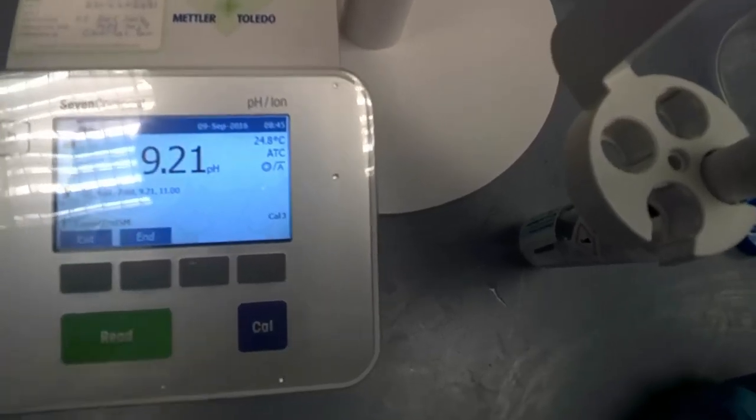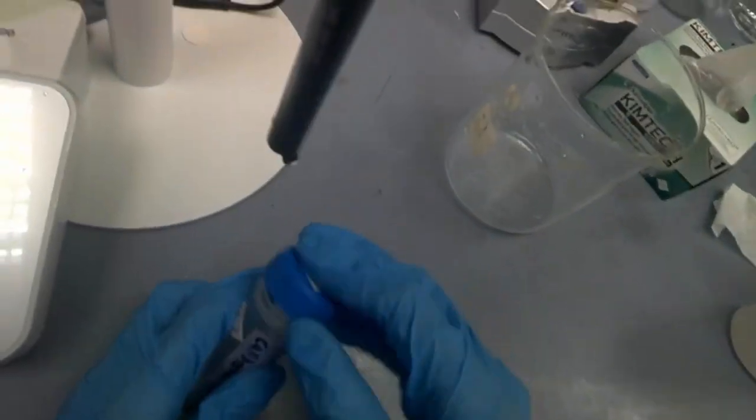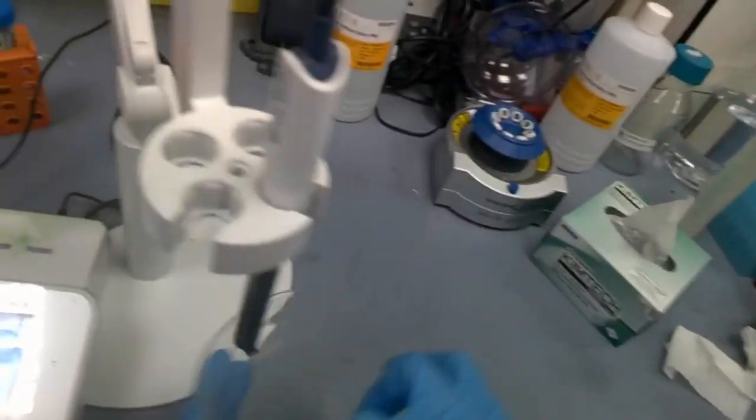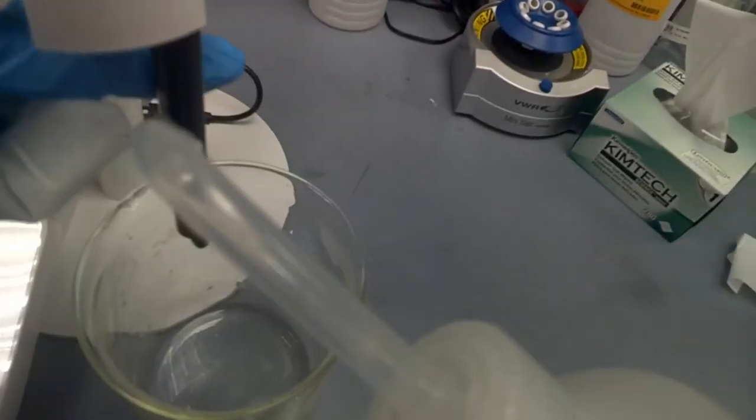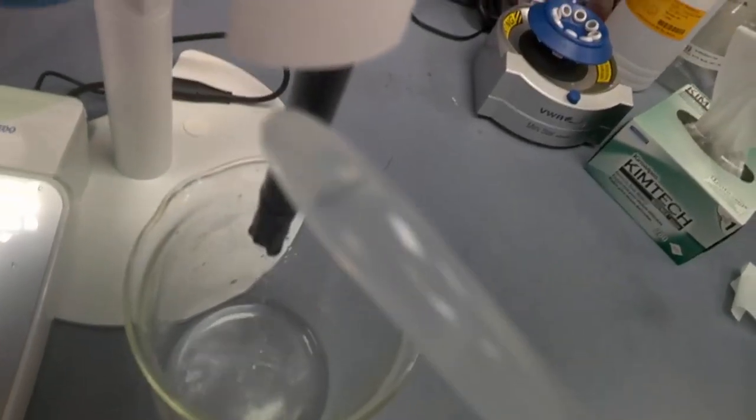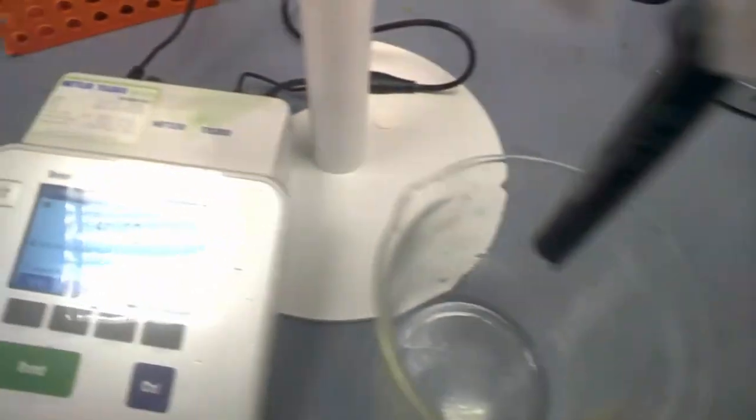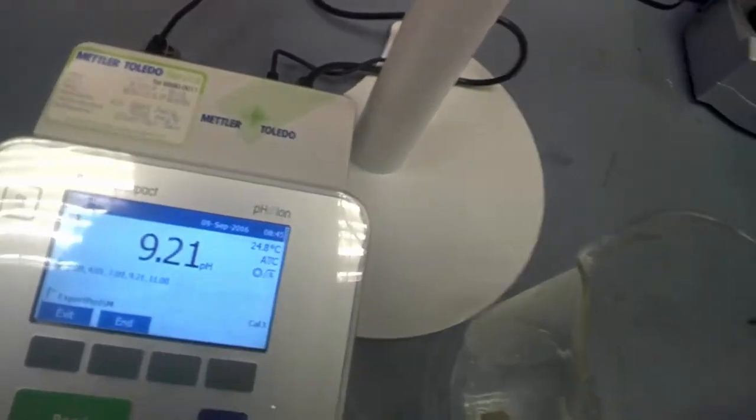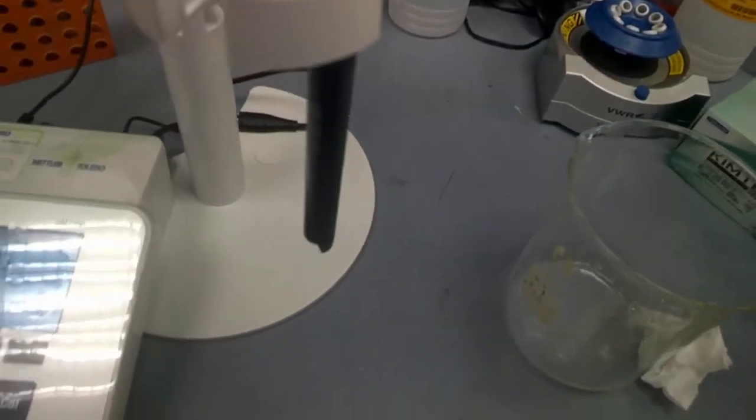It's 9.21. This time it's very fast. It's all done. So good. Now you remove the probe from the pH solution. Put it back to the stand. And before you measure the pH of the sample, don't forget to rinse it with distilled water, deionized water. Kim wipe. Be very careful. This is very delicate. Good. So now, let's say I have a sample of solution I want to measure.